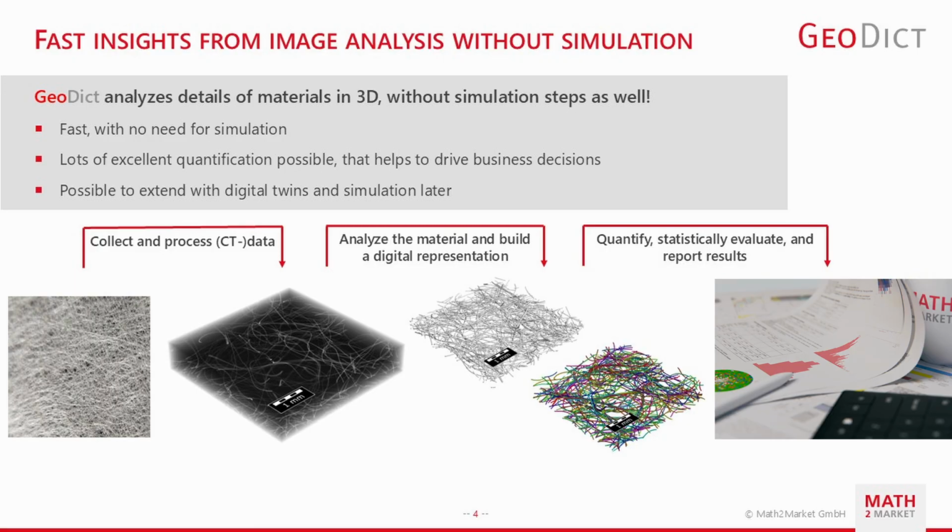In many real-world cases, customers don't need simulation to answer their key questions. They need to know: is this part acceptable? How does this sample compare to another? What changed in the manufacturing process? GeoDict's image analysis provides these answers quickly, objectively, and reproducibly.